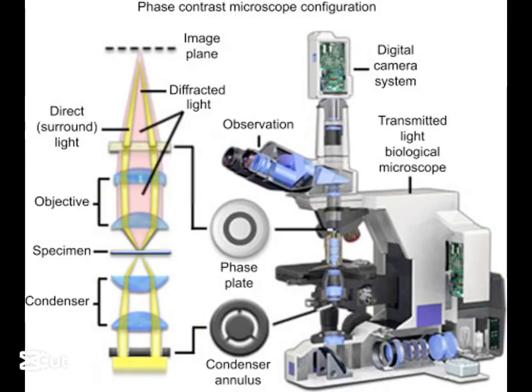This time we're all about microscopes. Perfect timing if you're in Mr. Martin's Year 7 science class. We'll cover all the basics. Look at how microscopes work, what all the parts are, and even how to calculate magnification. So don't worry if English isn't your first language. This deep dive will make it all super clear.